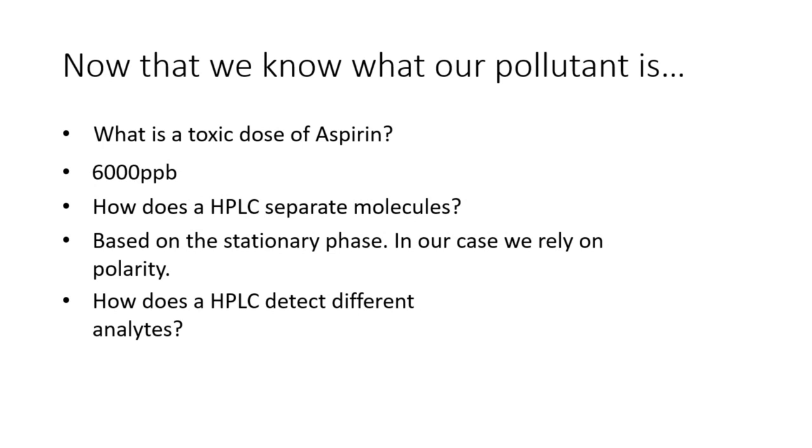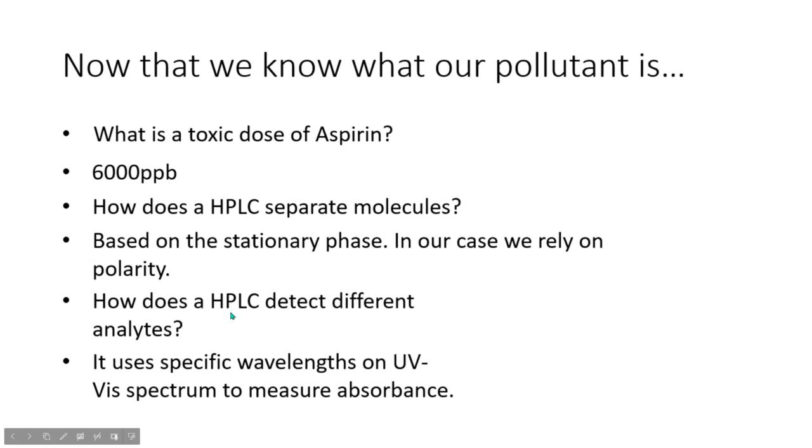So in saying that though, we also have our mobile phase, which we have to be wary of. We have to make sure that our mobile phase isn't going to absorb at the same frequencies as our analytes. There's some cool videos on it. You can look them up on YouTube. Just search UV vis detectors in HPLCs. I know it's a mouthful.